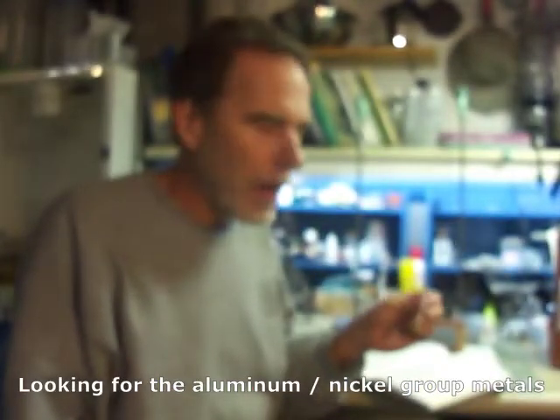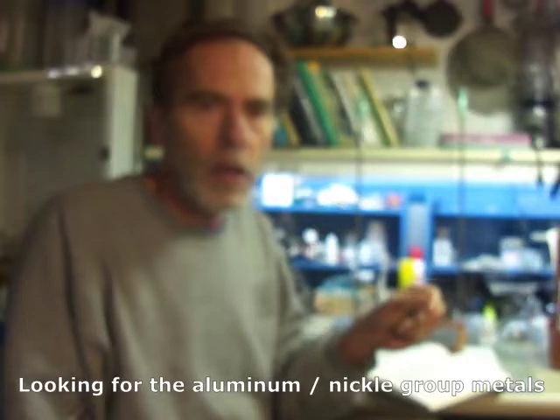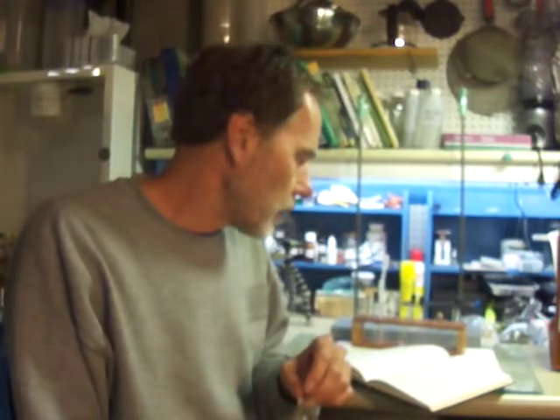Alright, we're getting somewhere now. We have a precipitate that is supposedly the aluminum nickel group. Now we're supposed to separate out the aluminum subgroup, which contains the aluminum, chrome, and zinc, from the nickel subgroup, which contains nickel, iron, manganese, and cobalt.